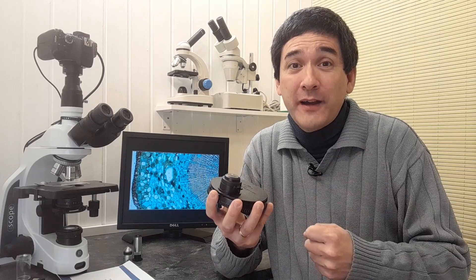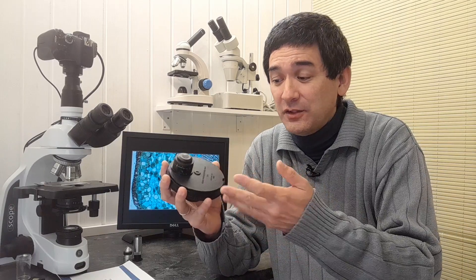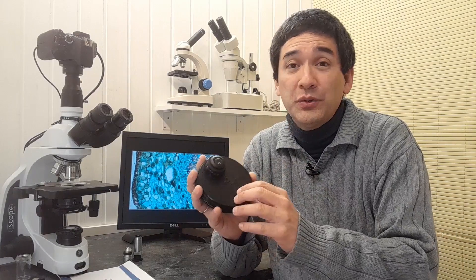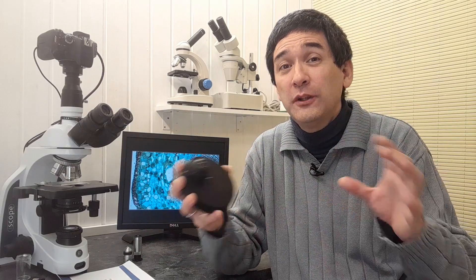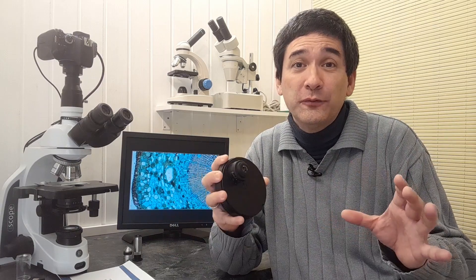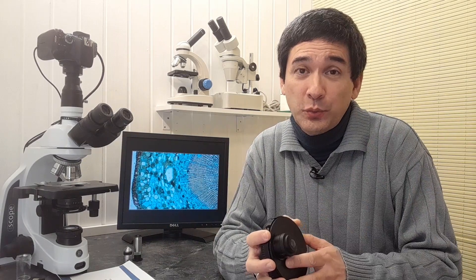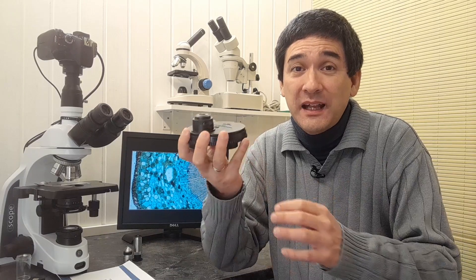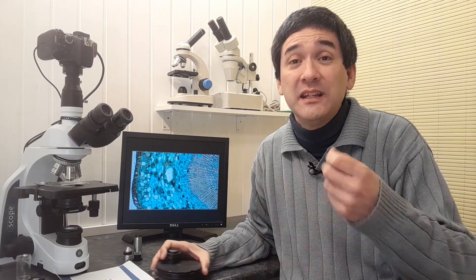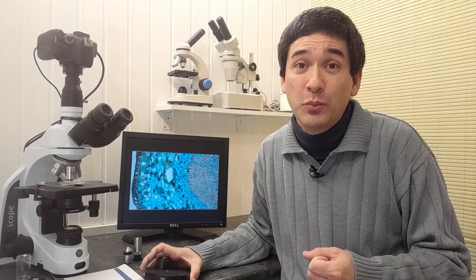That's a little bit unfortunate because the objectives and the condenser they have to match each other. And even from the same manufacturer, in this case this is a traditional Olympus condenser, even from the same manufacturer, if they're different series or different models then it might also not work. And you therefore need, besides the phase contrast condenser, dedicated phase contrast objectives as well.